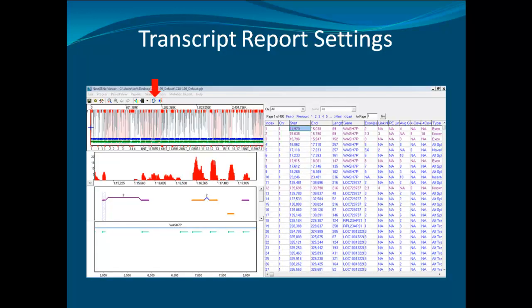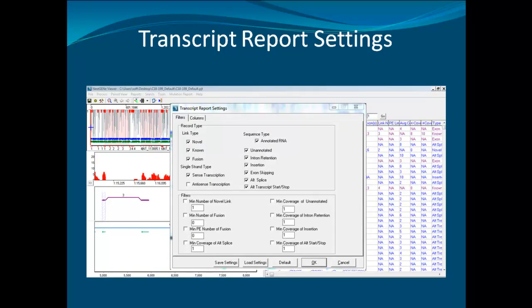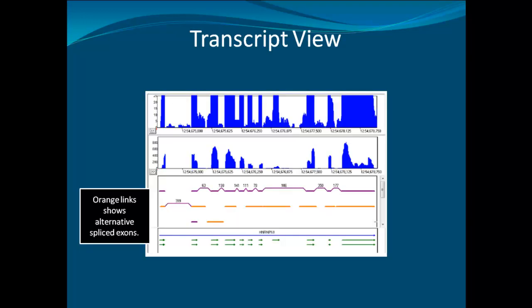In the transcript view, you can select the transcript report settings to change how the report is displayed. In the dialog box, you can select to display three different types of discovered links — novel, known, and fusion — or multiple different types of splice events, such as normal (the same as annotated exons), alternative splicing, and exon skipping. Multiple filters are included so that low-frequency events can be ignored. The report lists all exons and links together with one record per row. The columns of information can be selectively hidden using the columns tab of the transcript report settings.